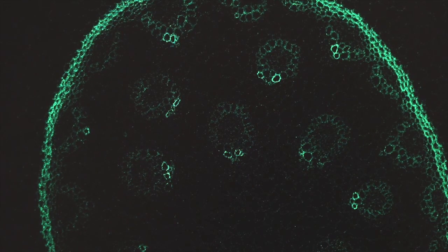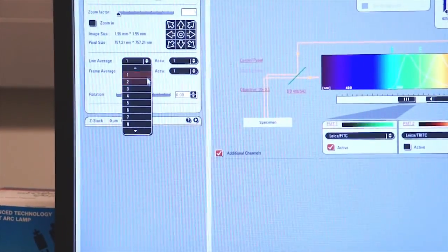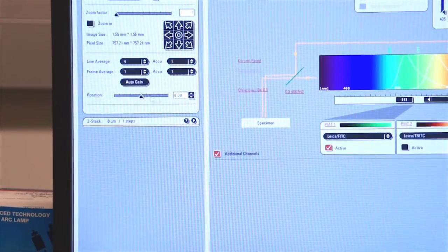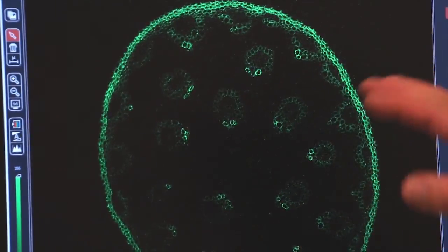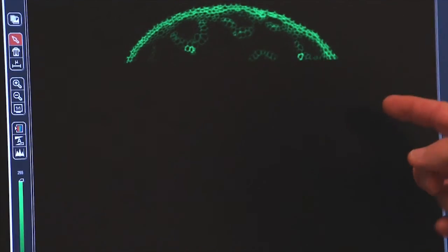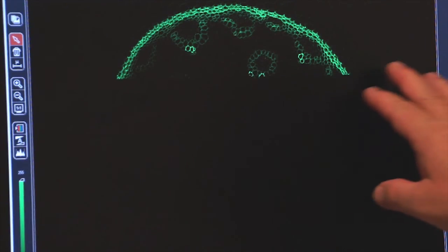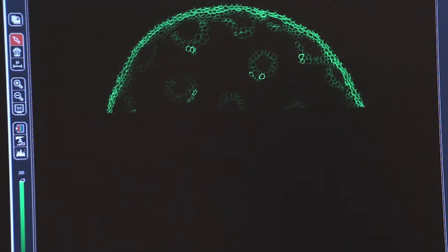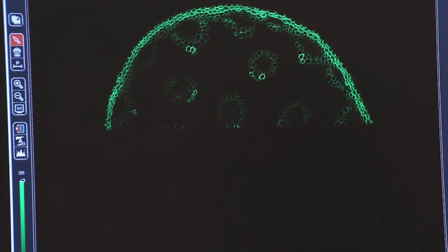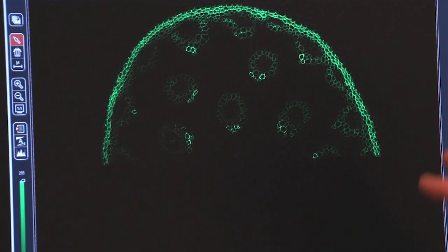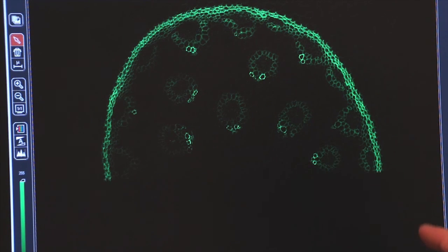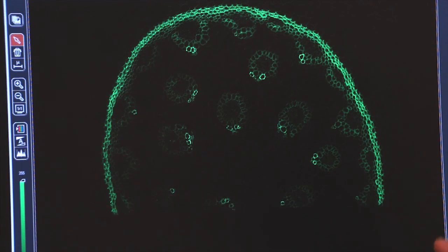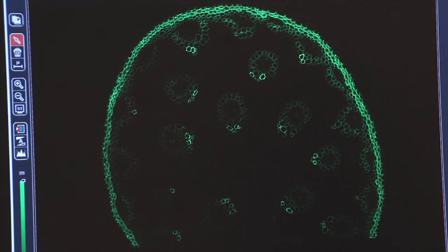So let's select a line average of 4, and we'll reshoot our image, averaging each line with 4 scans. Now you can see it's significantly slower, but look at how I've eliminated a lot of the noise from my image. So I'm getting a high resolution image, 2K by 2K, with a minimum amount of noise.